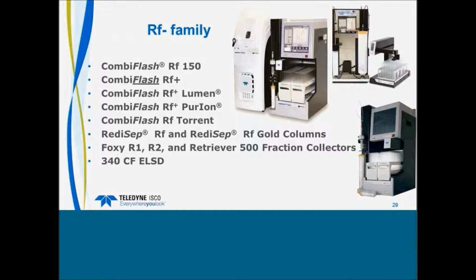This is run on the CombiFlash Rf system. One thing to note is once you find a method for your initial purification, you can go to a very large scale with the CombiFlash Rf Torrent.